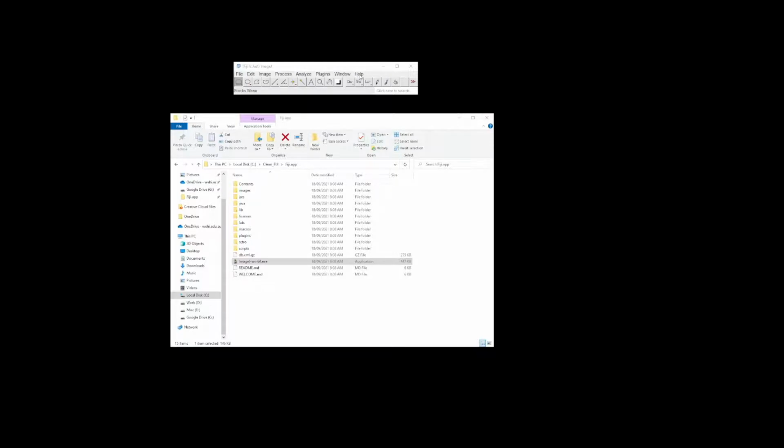So first thing, you get this window. So now you go to Help, Update, and as this is the first time starting up, you probably will get a few updates. So I'm just gonna run with it even if it tells me that I need to restart it, just so you see how the whole process is.